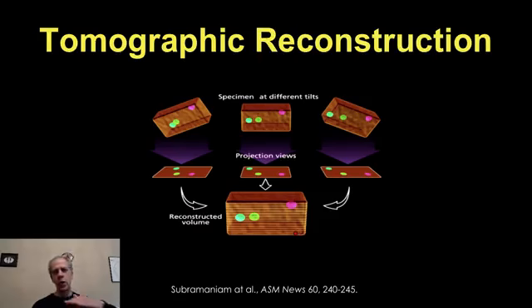So I'm going to always show you slices of this because most of the time I'm going to show you 3D when we get the reconstruction. But remember, this is supposed to represent this. And we obtain it. So here was the specimen, very, very tiny. And here is the image in the computer. Now, the image processing starts with putting all these projections together to get the 3D.